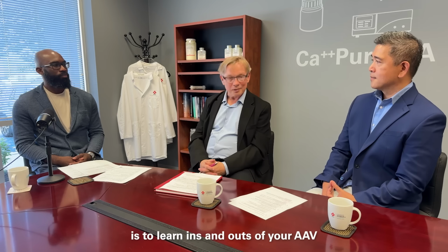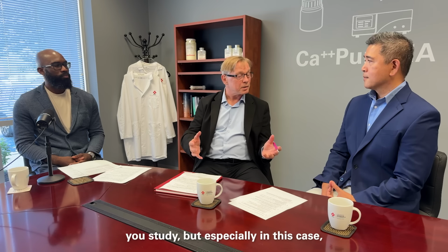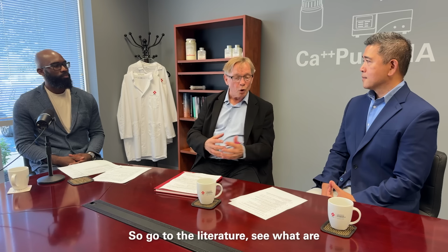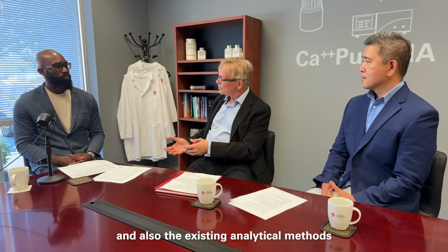No, absolutely. When a new project comes to the table, and you are going to start it, I would say the first thing is to learn the ins and outs of your AAV or any protein you study, but especially in this case, learn AAV. So go to the literature, see what the existing purification methods and analytical methods are, and think about what we can offer from Tosoh, or whatever your company is.